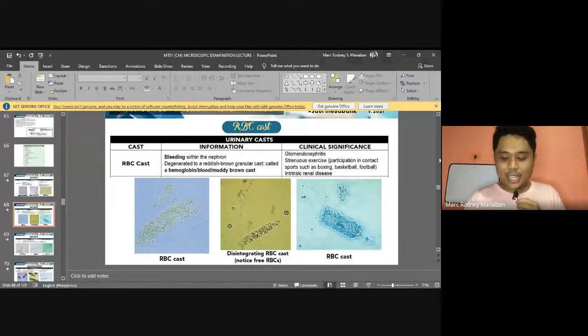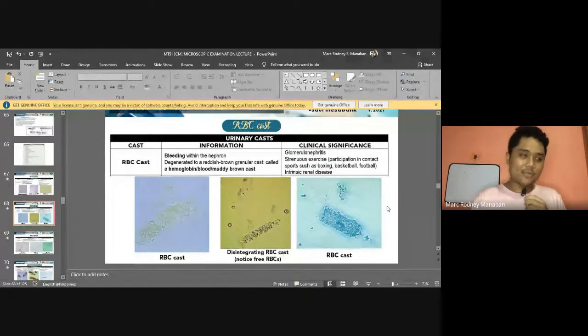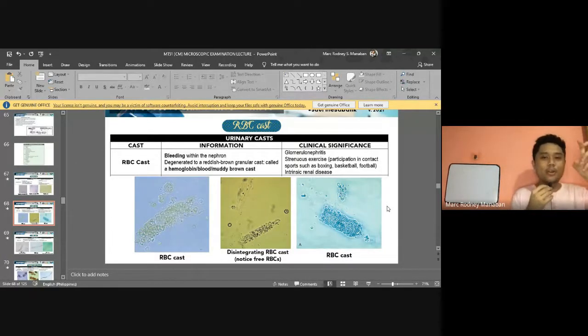Now we go to your RBC cast. By the name itself, RBC cast is a cast that contains RBCs. So from hyaline, RBCs are incorporated, alright? And what is the clinical significance of this? The presence of your RBC cast indicates bleeding, bleeding within the nephron.